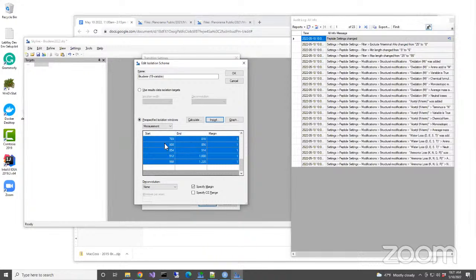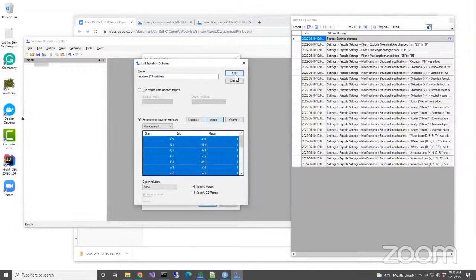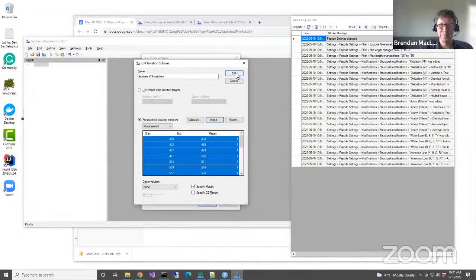Could you also just save this document and share it? Okay, sure. Just a second. Well, we're almost at the end. Everybody can download the template, and this is just creating the template. If you don't get here, you can download the template, and that will be it. So I think we're going to move on, and I will rethink this in case people don't have raw data.